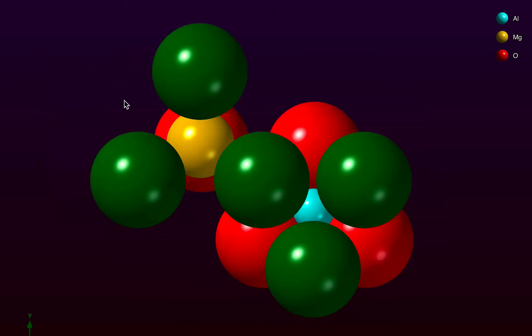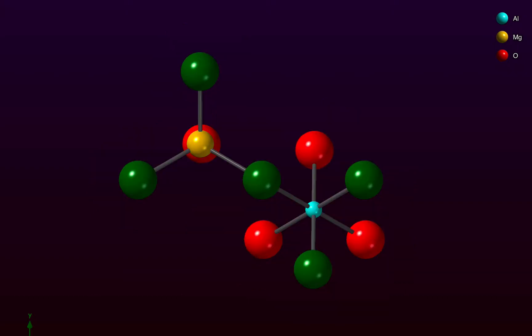And now we have the atoms shown for the coordination groups. Now if we go back to a ball and stick model then we can see the groups of atoms around magnesium and aluminium.